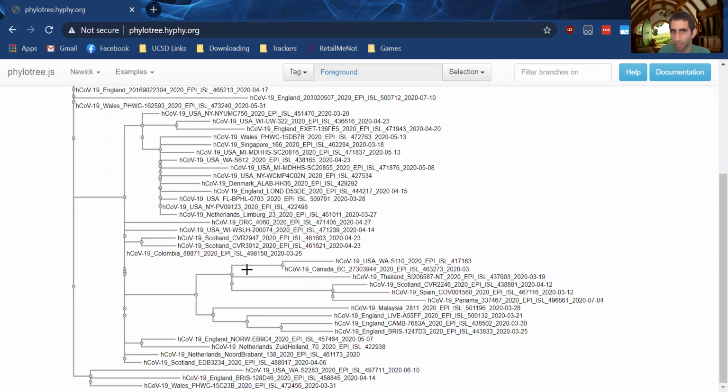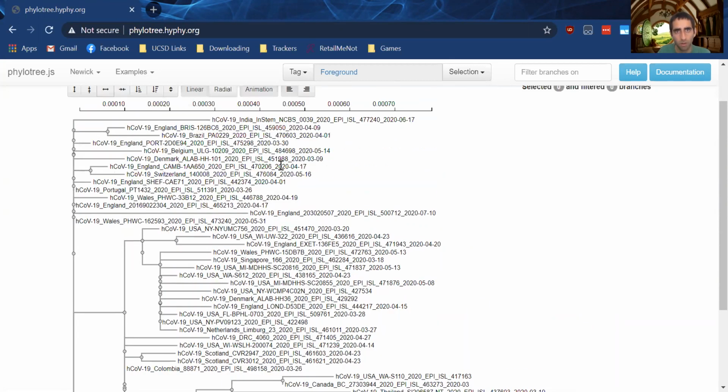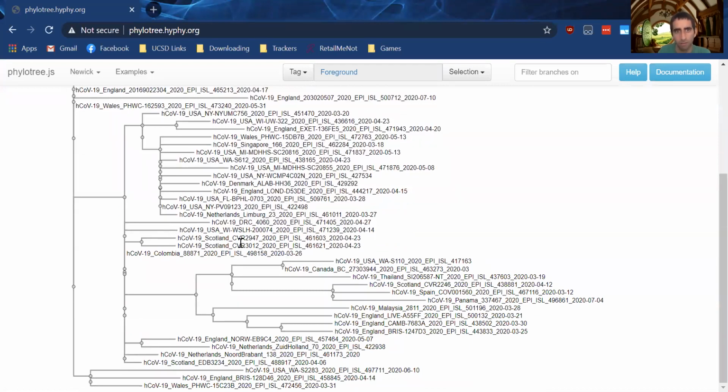And yeah, so the next steps would be, if I had any metadata, I could overlay that metadata onto these. So let's briefly look at this. You'll notice that these England sequences are all grouping together. Then we have a Malaysia sequence. We have a couple Scotland sequences next to each other. Ideally, what we would hope is that sequences coming from a similar source of infection should cluster together closely in this tree. And based on this small subsampling, we do roughly see this.